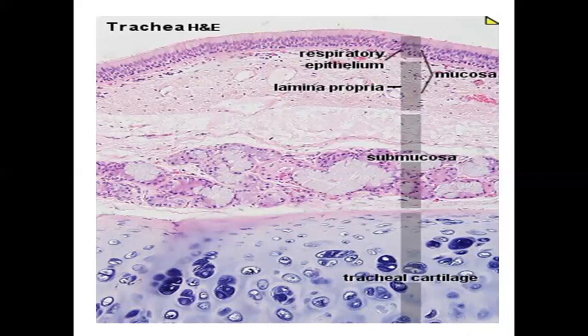Mucus and seromucous glands whose ducts open at the epithelial surface. يعني هذه الجلاندز اللي موجودة هنا عندنا open الduct مالتها open to the surface of the epithelium. زين. بعدها شنو ممكن also we can see a dense layer of elastic fibers. تمام. هذه كلها باللامينا بروبريا. طبعا هذه الالاستيك اللي هي تفصل لنا اللامينا بروبريا from the submucosa. تمام. اللي هي اللي بعدها الطبقة اللي بعدها.